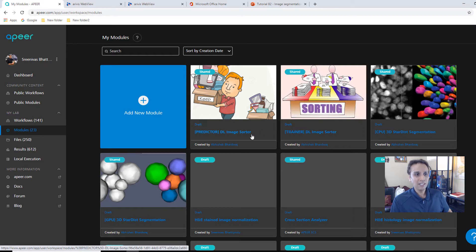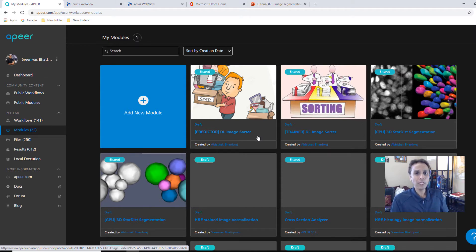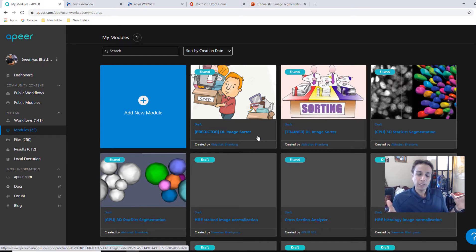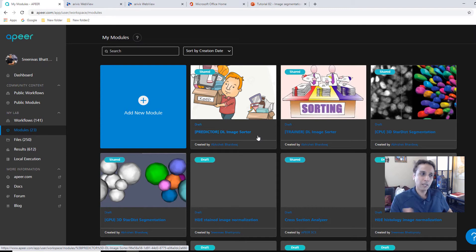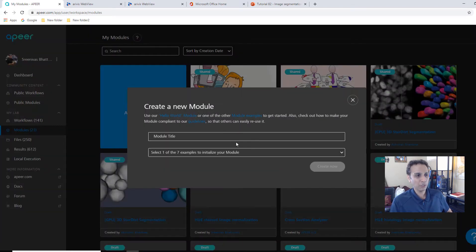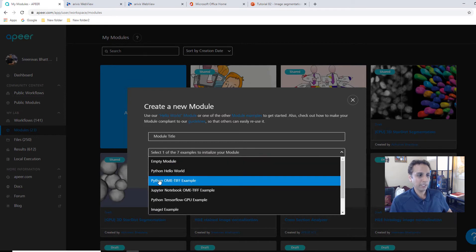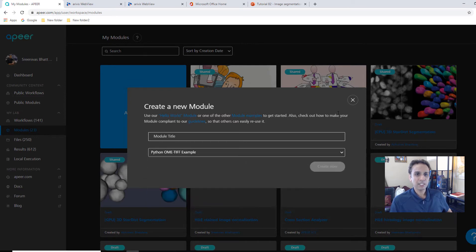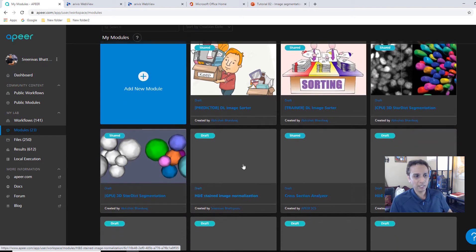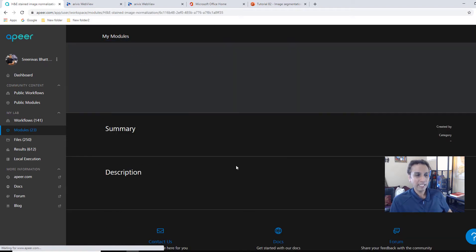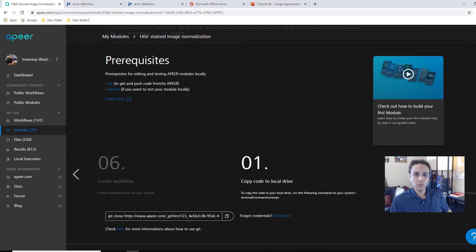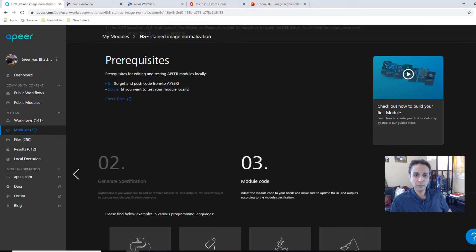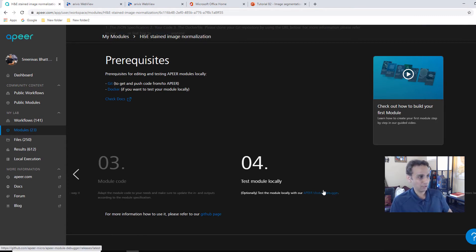And you can connect these modules. That's the beauty of it. And here is a couple, which one of our student interns actually developed. These are again great modules where it is using deep learning to train a whole bunch of images, good images and bad images, and then it's going to sort good and bad. Why is it useful? Well, if I'm automating my analysis pipeline, why would I waste my computing time on bad images? So it sorts automatically and then only the good ones can be analyzed in future. So this is how you can automate your workflows.